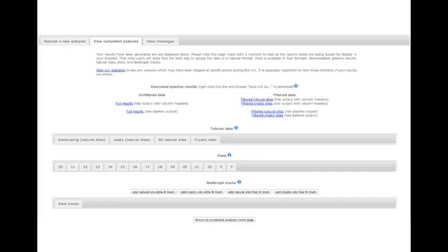In this tutorial video, we'll be examining the 4 different results formats generated by the Shannon pipeline and detailing their usage. It's assumed that you've executed the Shannon pipeline on a VCF file that you've uploaded and you'd like to learn more about the results you've been presented with. To arrive at this screen, we've clicked on the View Results of Run link from the View Completed Analyses tab.